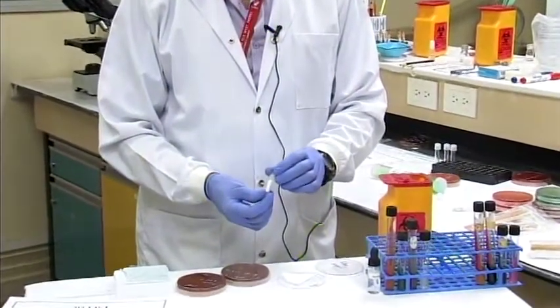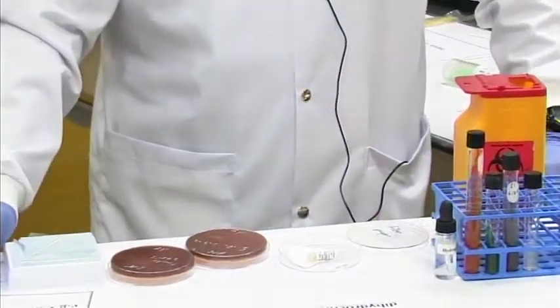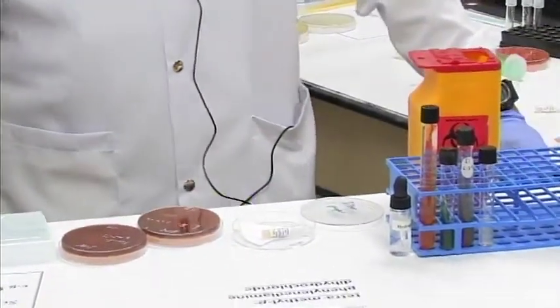So the principle of the oxidase test is to look for the enzyme, the cytochrome C oxidase enzyme. To demonstrate that, the reaction consists of using oxidase reagent, which sometimes comes in these little ampules. And this oxidase reagent is named tetramethyl p-phenylene diamine dihydrochloride.